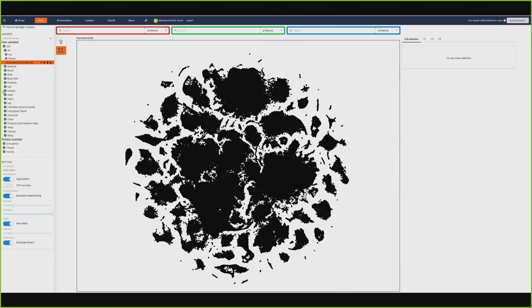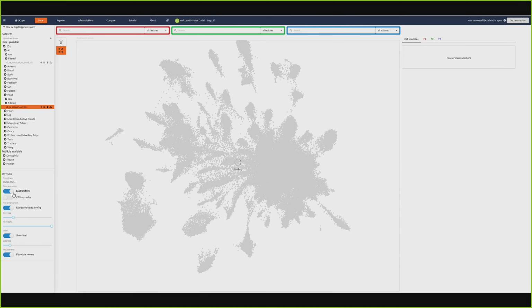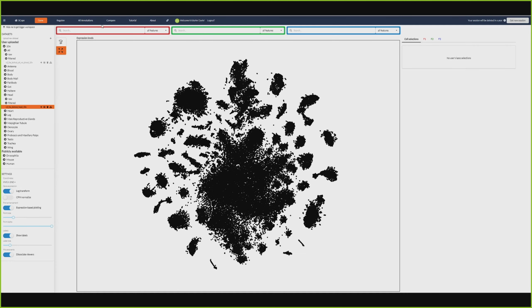Another part of the data, which I haven't shown so far, I'm going to actually go to a different tissue here. So I'm going to switch over to the head data set, and we're going to look at Regulons. So this was shown earlier. Again, Anna introduced SCENIC a bit for me earlier, so I'm not going to go over what SCENIC does. But we're able to look at Regulons.